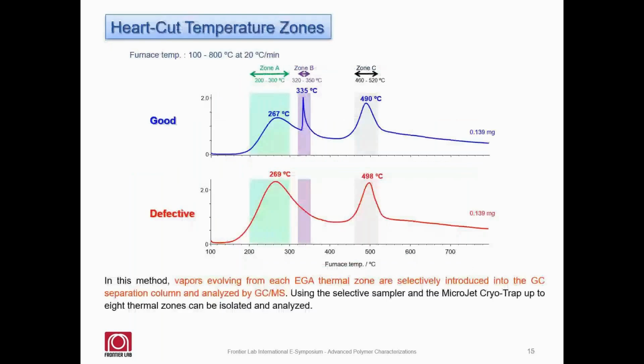Thereby we quickly performed a heart cut analysis using an accessory, as Michelson already pointed out in his previous talk.